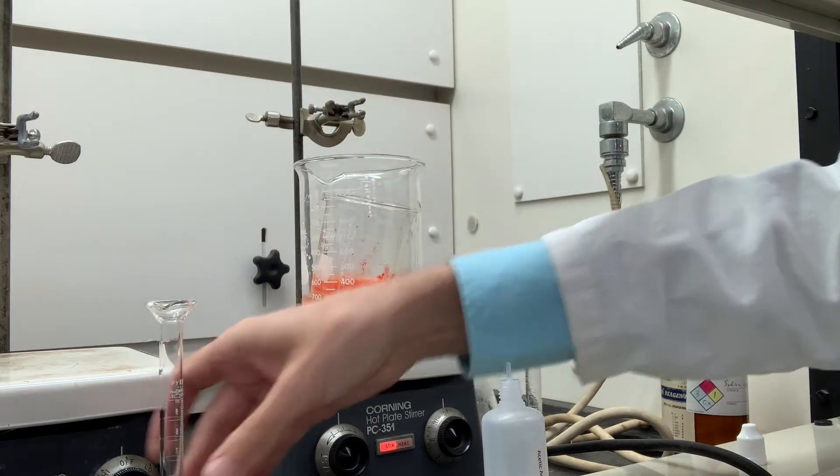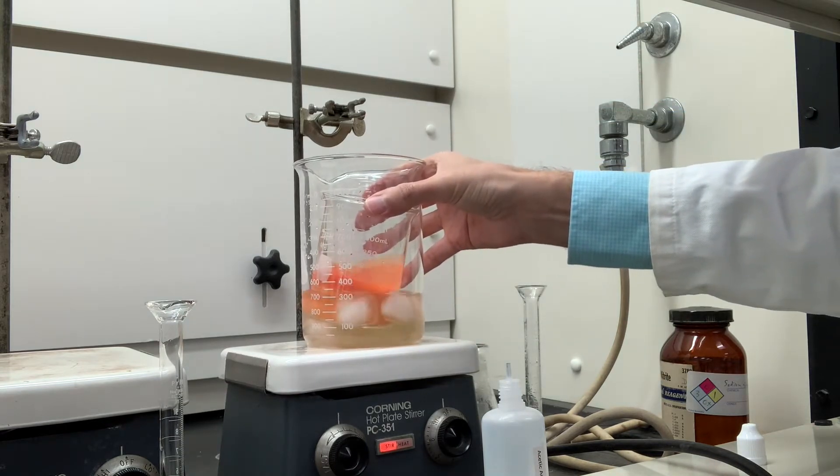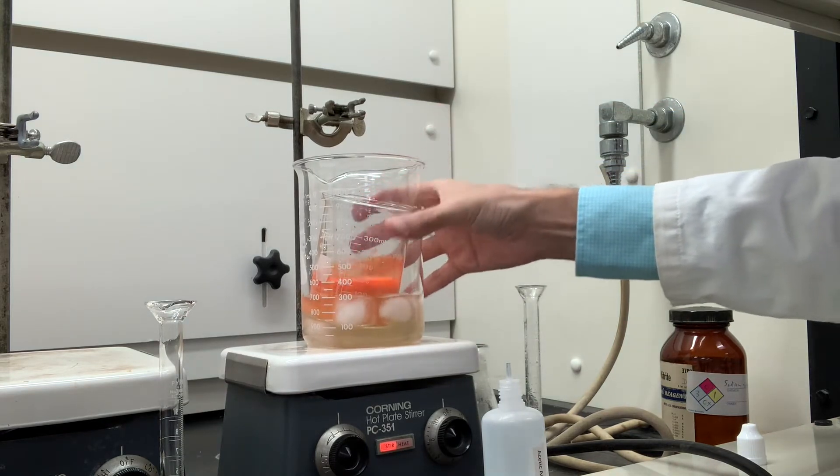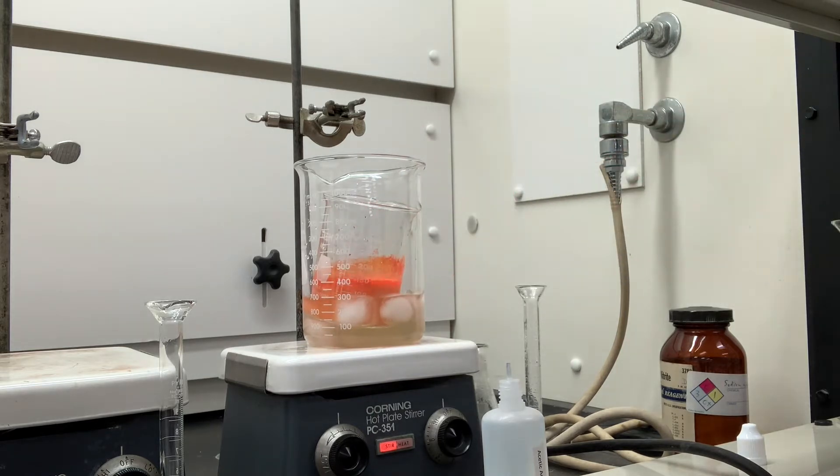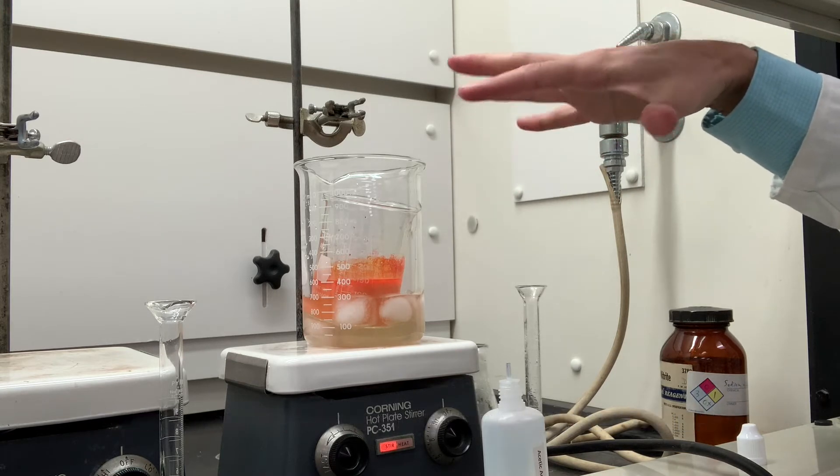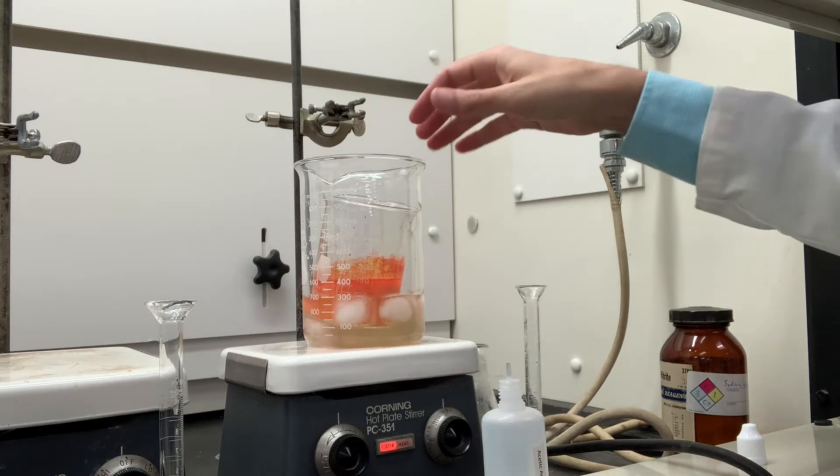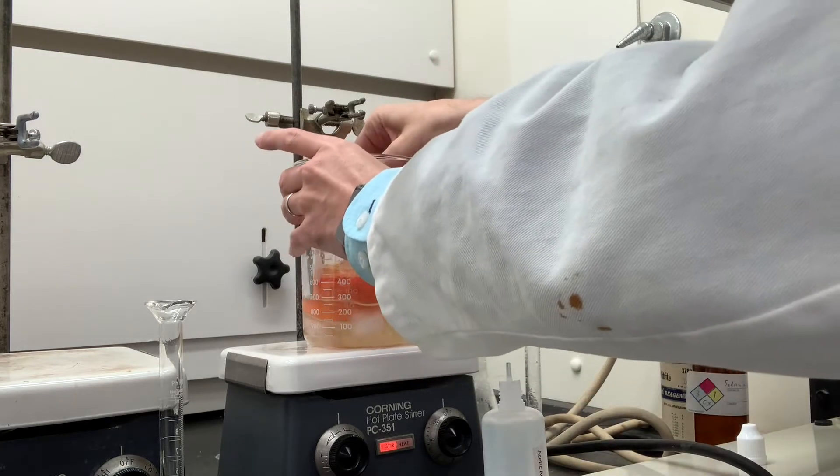As you can see, the color is beginning to change to a deep reddish orange there. And the procedure now says to stir this at room temperature, 20 to 25 degrees Celsius, for about 20 minutes. So I'm going to take this out of the ice bath.